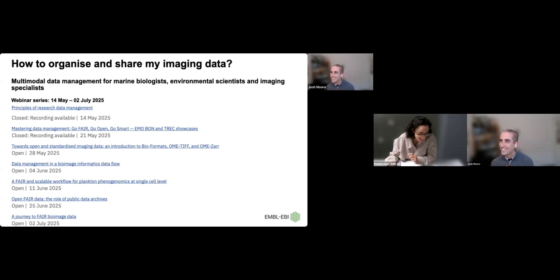No, it's just because the person that asked before about the company modifications on the file wrote down a more detailed version, so I would just take this one so we conclude with the initial question. It was saying that if the microscope acquisition software changes, because maybe there is a new release from the company, then the metadata of the images entirely changes, and they were experiencing, for instance, some Python libraries not functioning anymore. So yeah, okay, I understand.